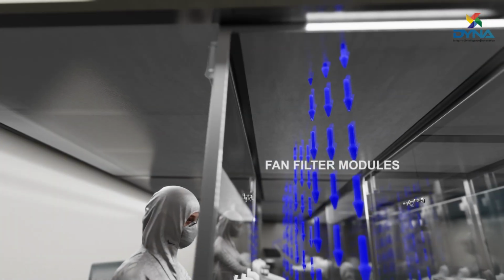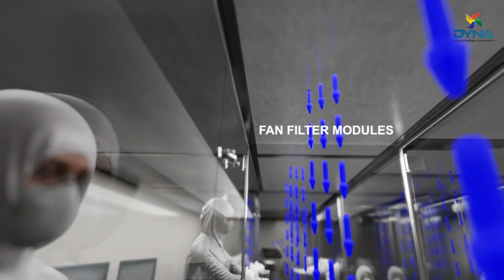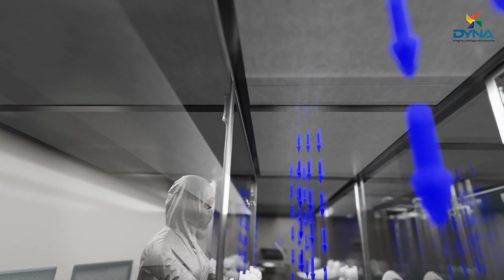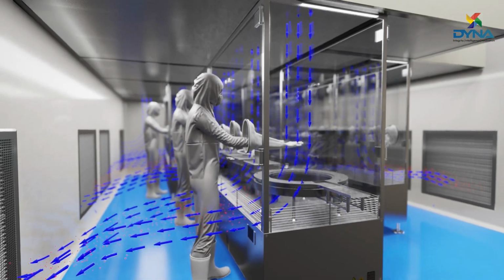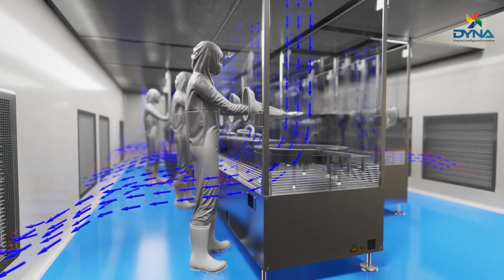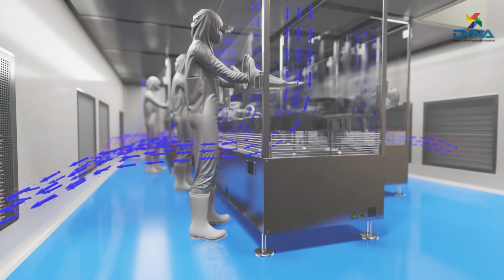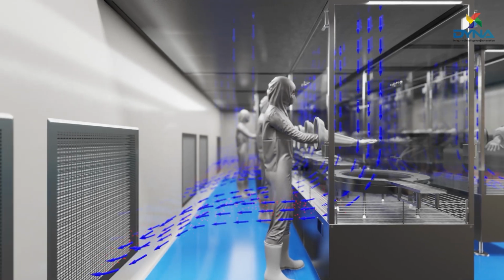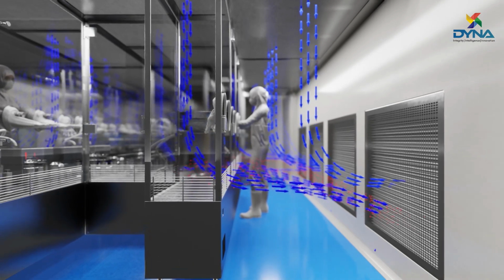Within the fan filter modules, the air undergoes filtration with HEPA filters, and then diffuses through a CG screen inside the work area. The filtered air, now in a laminar flow, circulates within the work area, and exits through the louvers beneath that area. All the contaminated air, along with the remaining air inside the room, is then channeled through a return air riser, equipped with a filter.